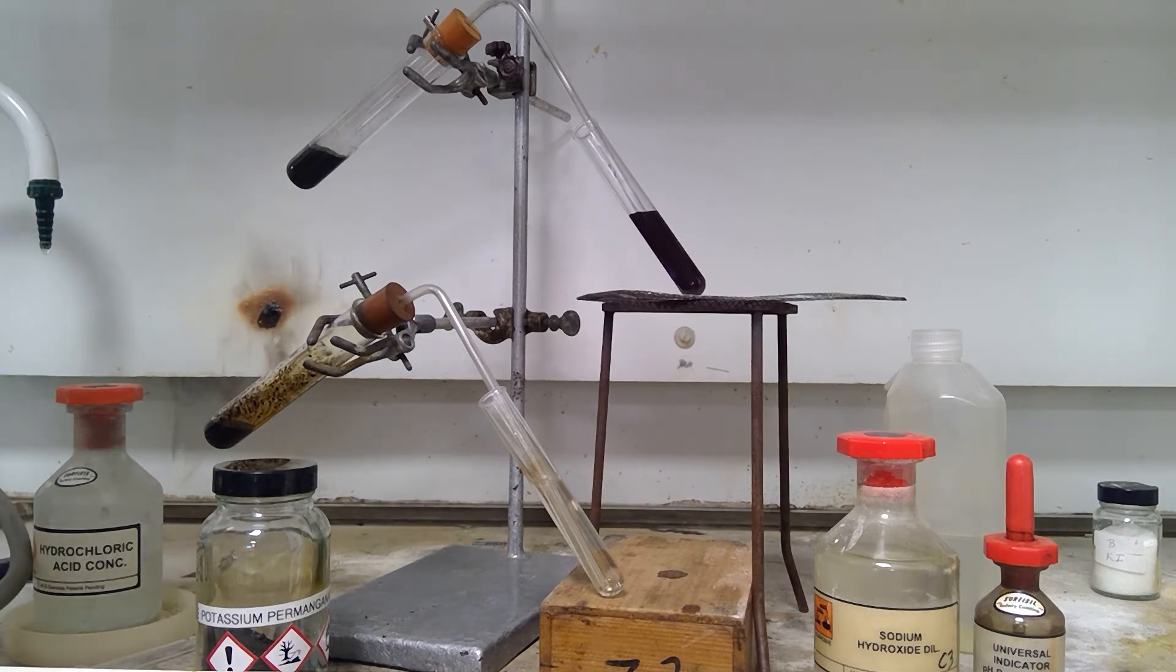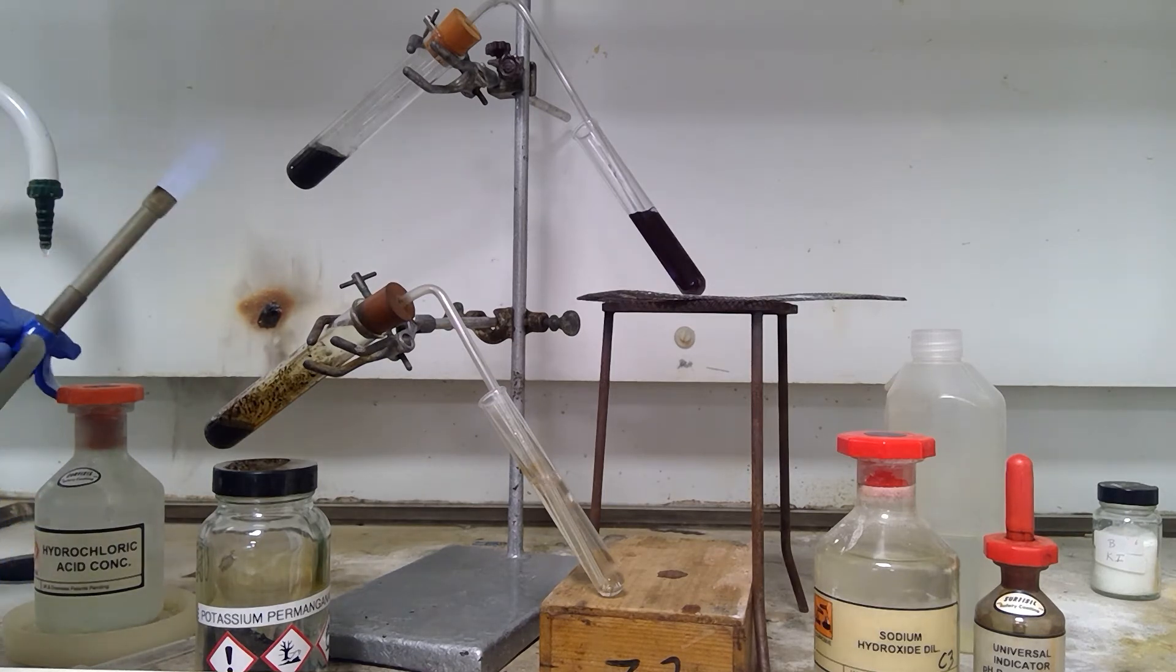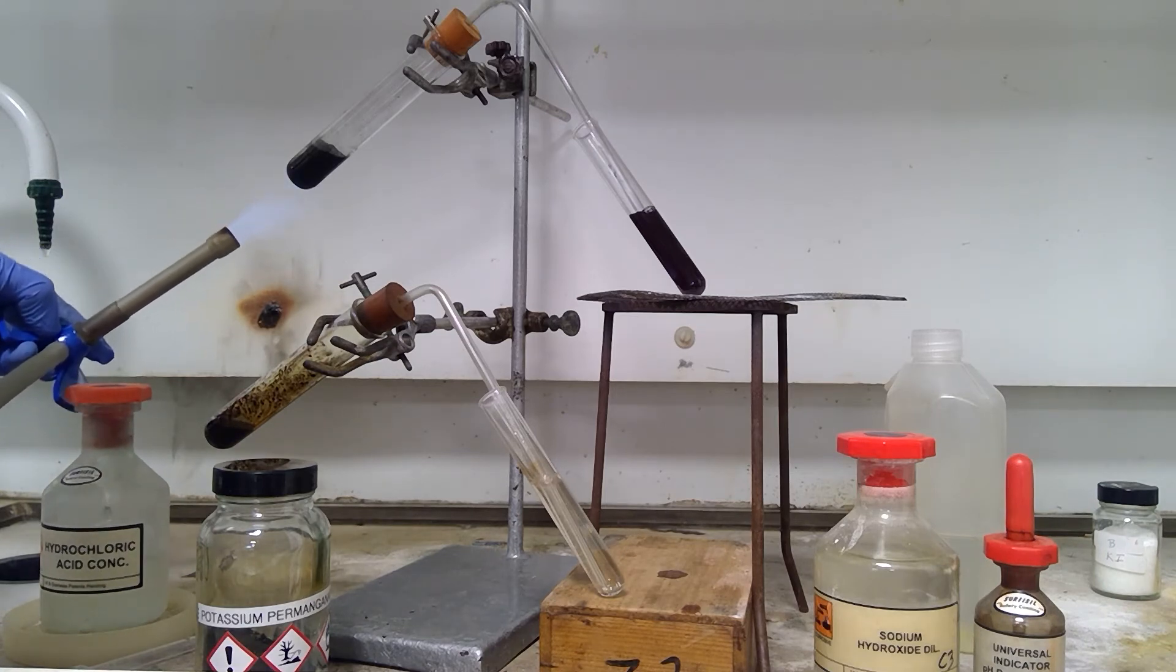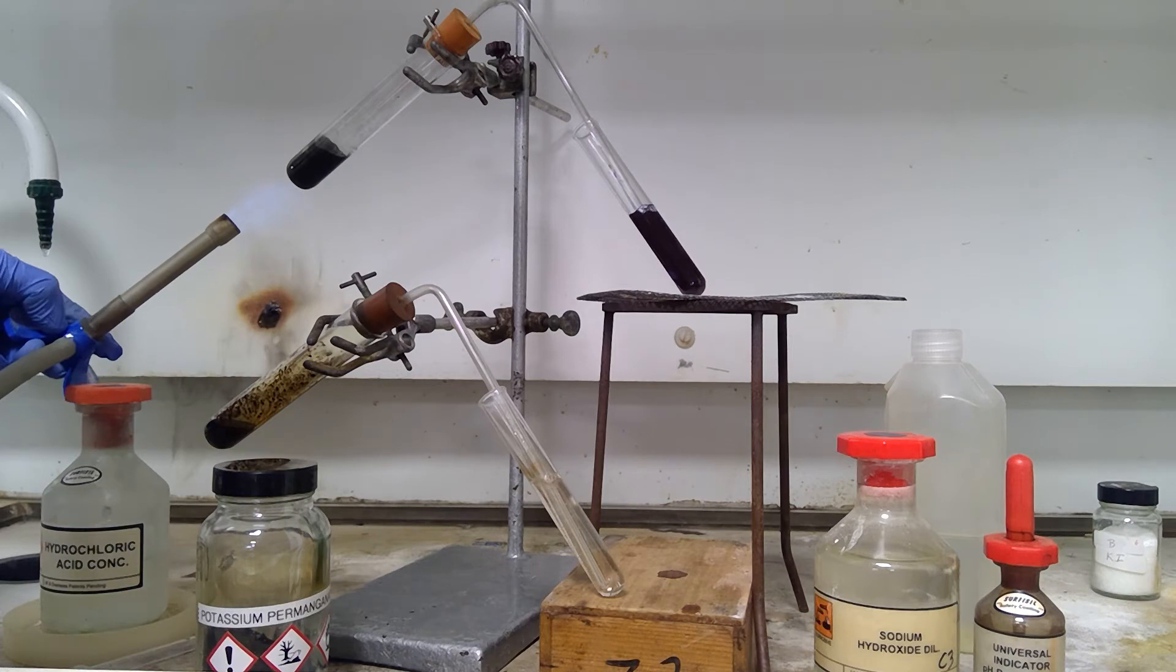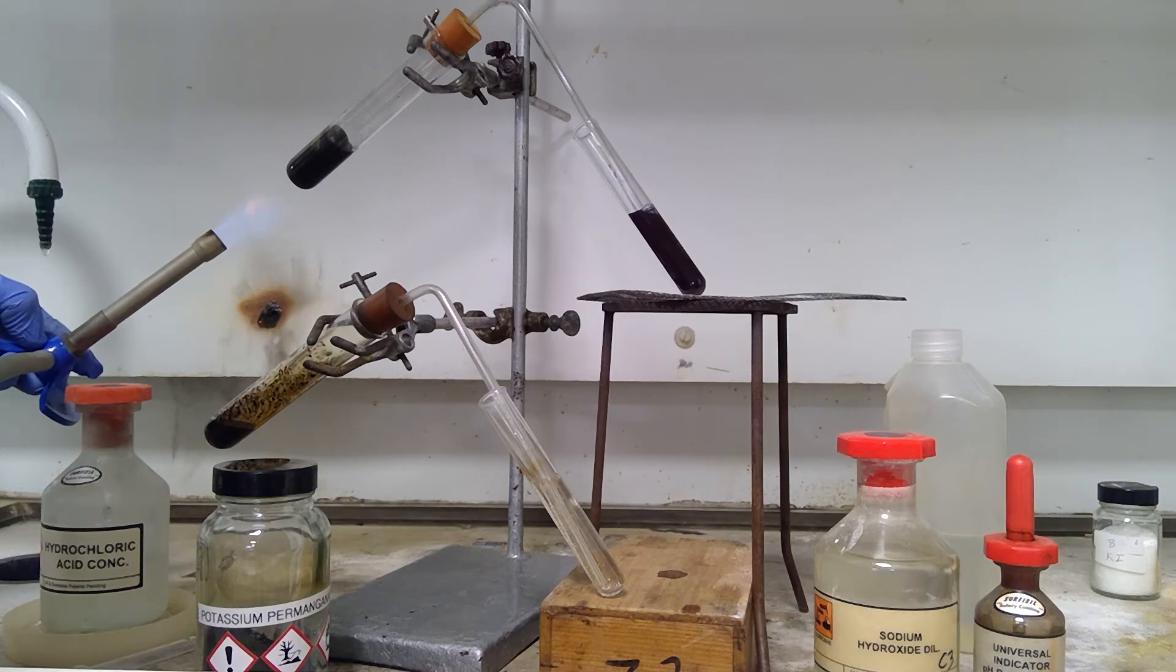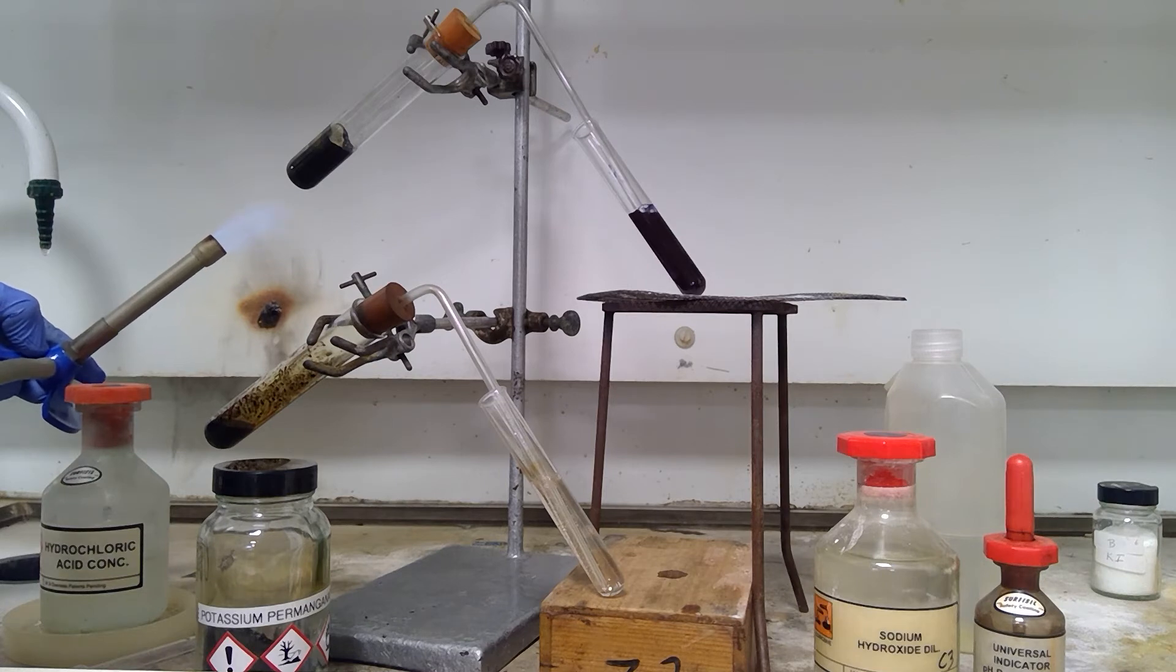But we will just encourage this by warming a little bit. And this can be seen as well in the video produced by Dr. Morse, where he looks at using this reaction to produce some chlorine for a displacement. Just warm this gently, and you can see that a gas is being produced, but clearly at a much lower rate than the rate that we get with the permanganate.